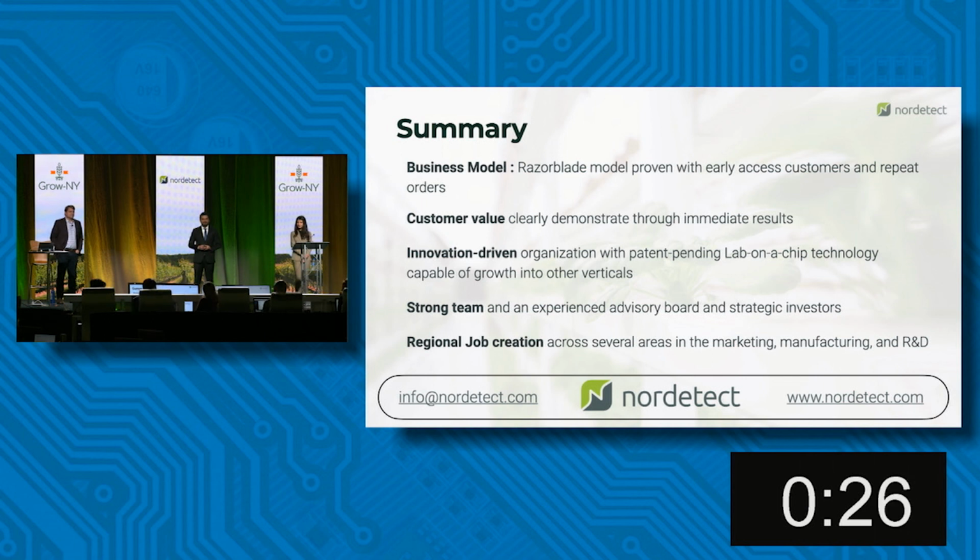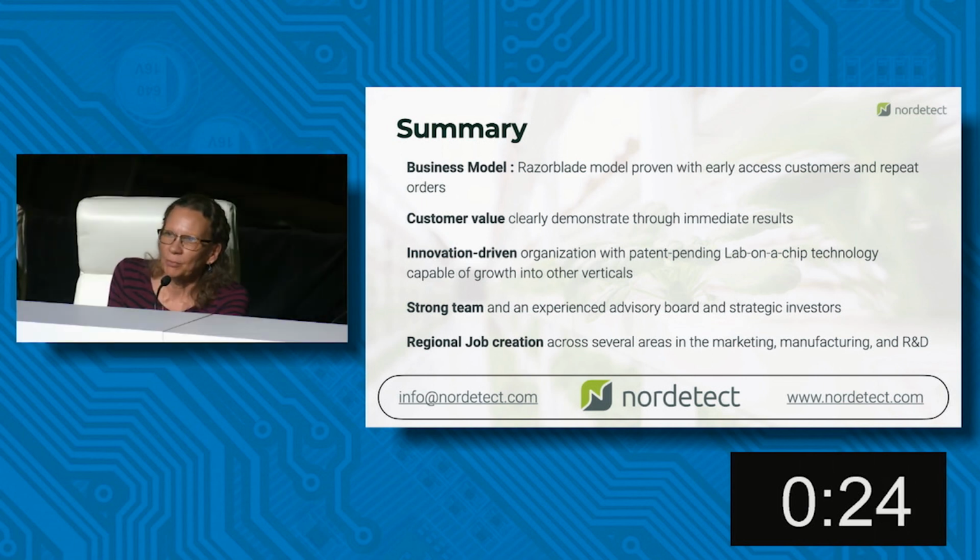Okay, sorry. Are you thinking about adding more micronutrients to your capabilities, especially foliar samples and micronutrients on them? That I see is something that I know we use in the middle of the growing season, and we need to know the results fairly quickly.